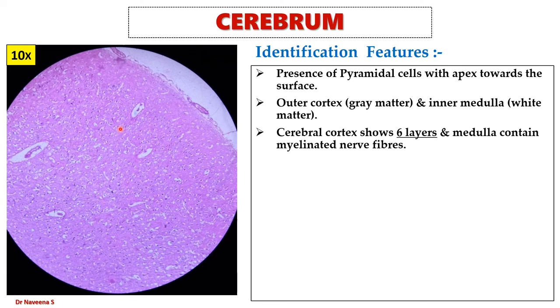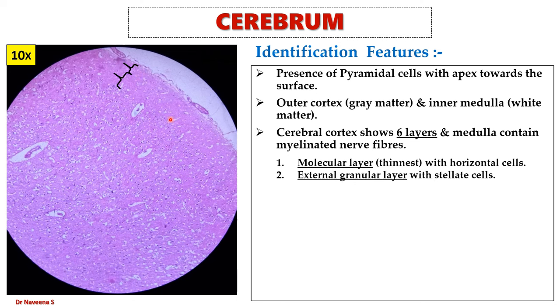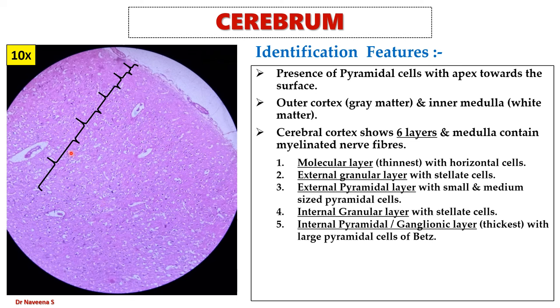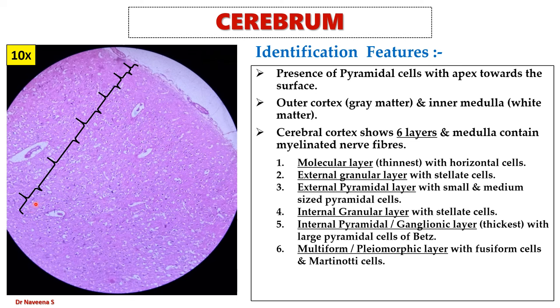Let's see the layers within the cerebral cortex. The outermost layer is called the molecular layer, which has horizontal cells. Deep to that is the external granular layer with stellate cells. Deep to that is the external pyramidal layer which shows small and medium-sized pyramidal cells, tightly packed. Deep to that is the internal granular layer with a large number of stellate cells. Deep to that is the internal pyramidal or ganglionic layer with large pyramidal cells or cells of Betz, which are loosely packed. The deepest layer is the multiform or pleomorphic layer with fusiform cells and cells of Martinotti.